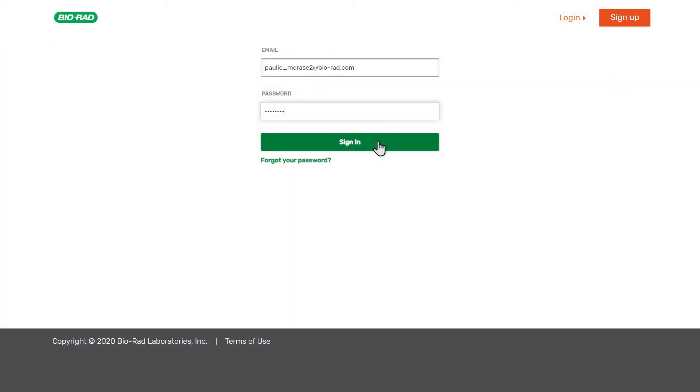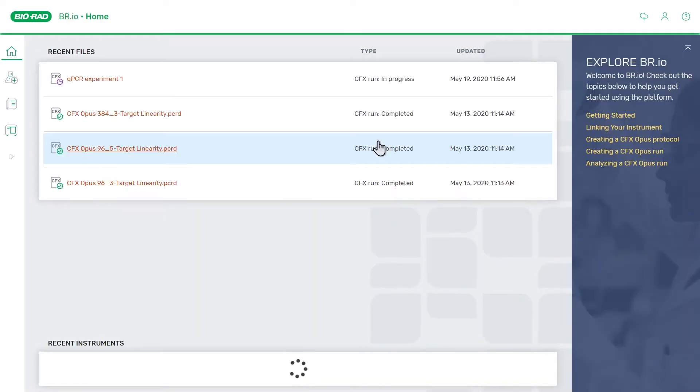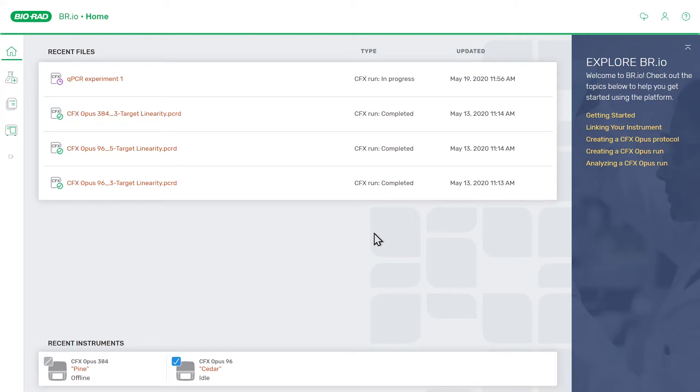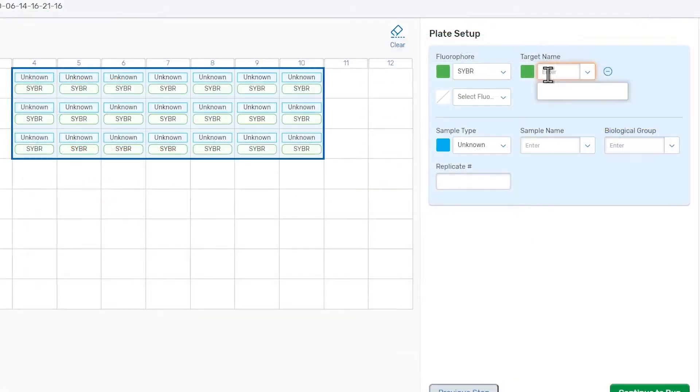The BR.io Cloud Platform is a secure web-based platform that integrates with CFX Opus real-time PCR systems, providing you with a modern workflow for defining, running, and analyzing your real-time PCR experiments. It is designed to promote efficiency in your lab's workflow by giving you the flexibility to use the application anywhere.